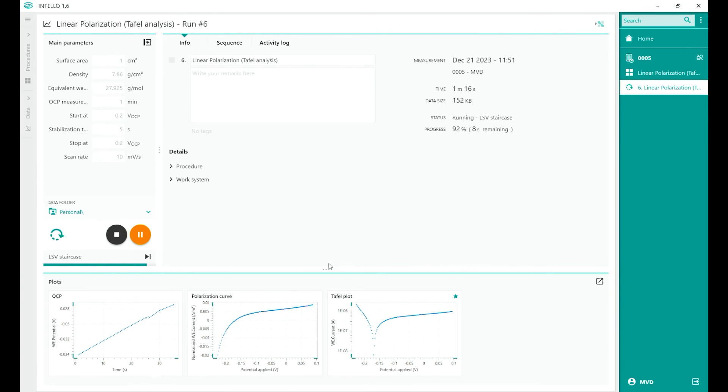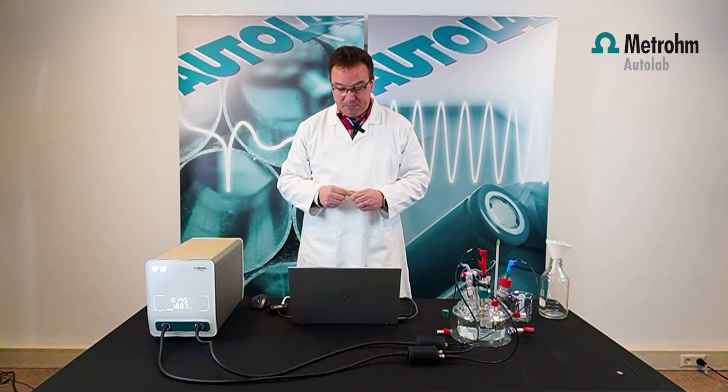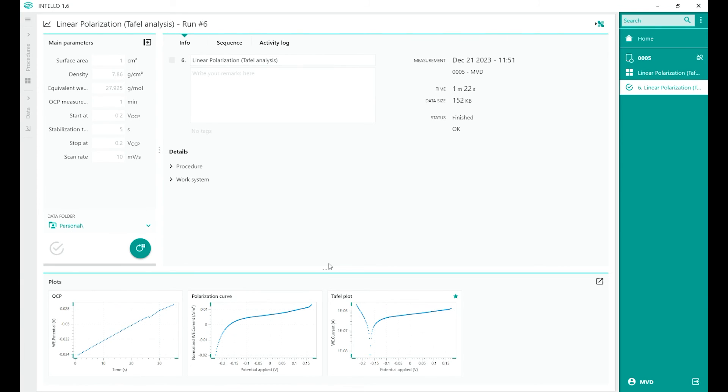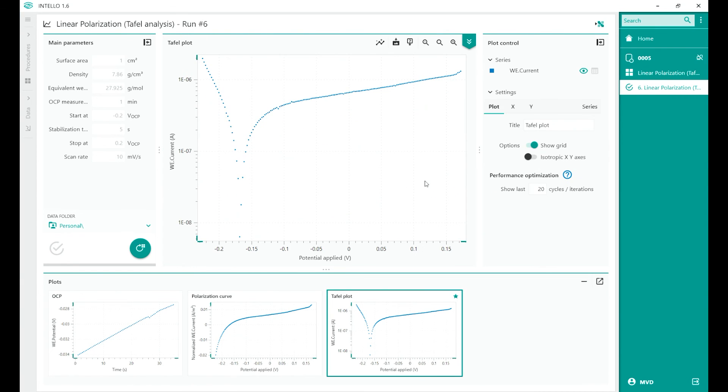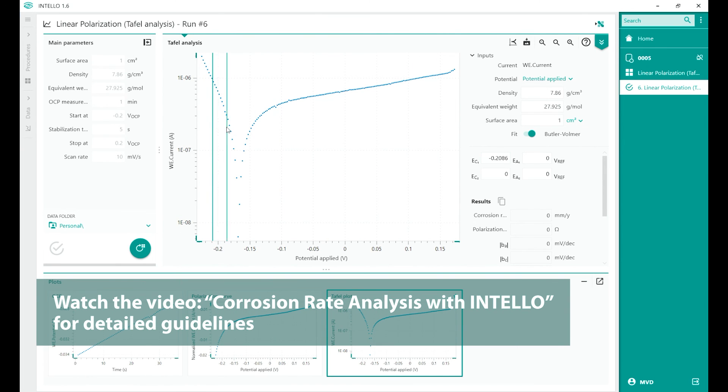Such markers define the lines for the linear regression according to the TAFEL equations. The measurement is finished. I can double click on the TAFEL plot. On the TAFEL plot, you can find perform analysis. There's the corrosion rate analysis, TAFEL analysis. We can set the markers on each part of the branches.